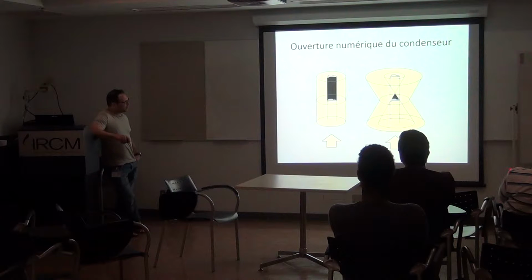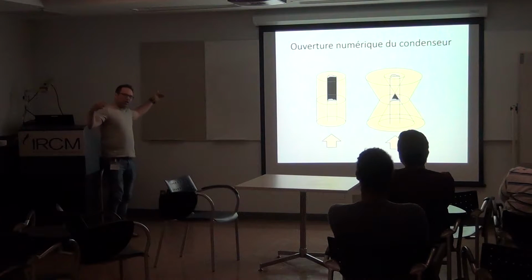But if your rays have a certain angle, the light is going to be blocked by those straight rays, but if the rays arrive from the side, then it will not really block all the light. Okay? And this is where you get details, having a really high numerical aperture, or really high contrast if you reduce this aperture. It will block light, and that's it.